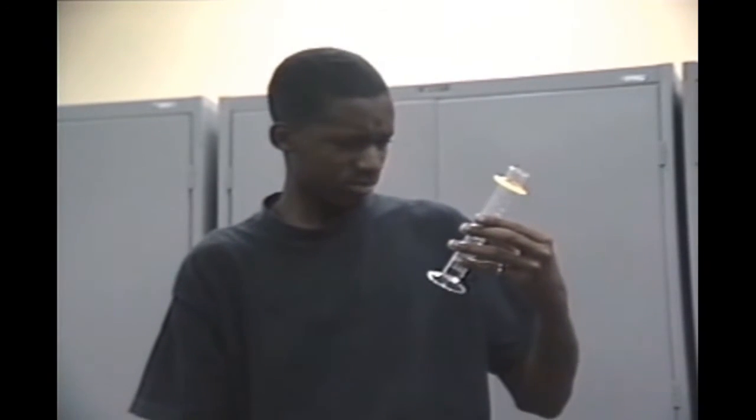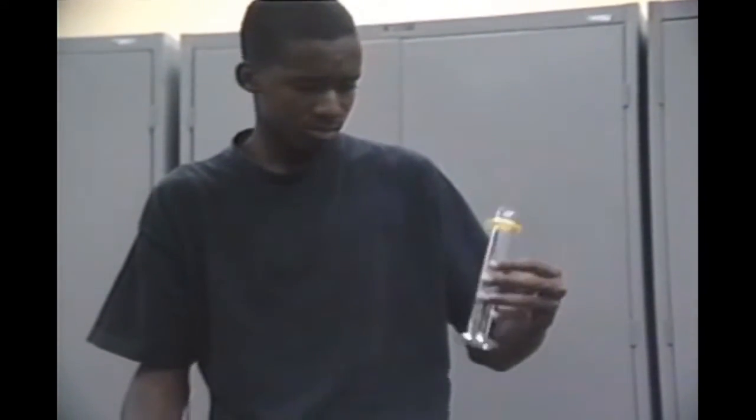When making a reading, it is essential that the graduated cylinder is sitting on a flat, smooth surface. You can't get a good reading while holding the cylinder in your hand.